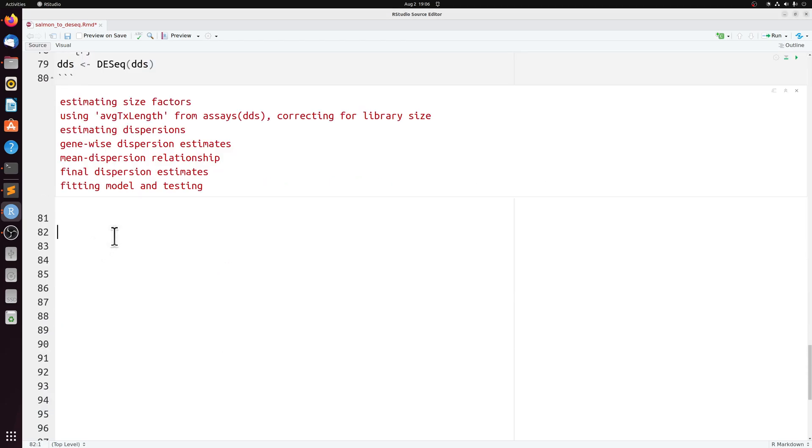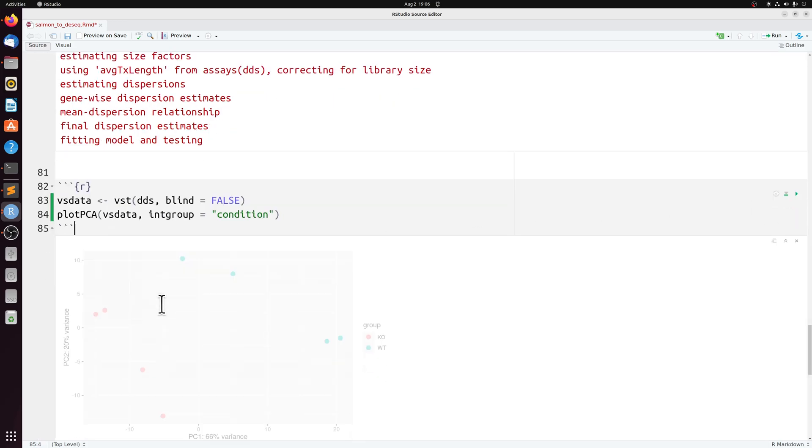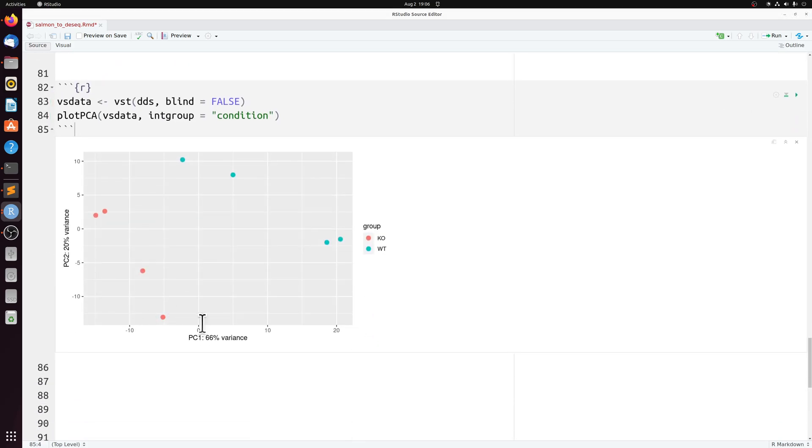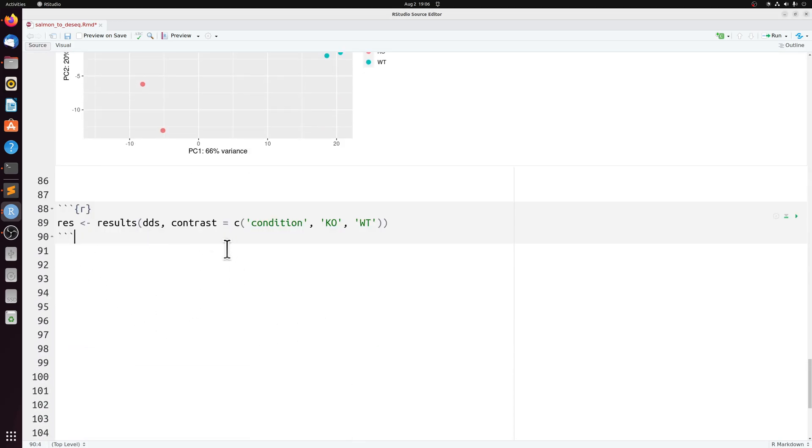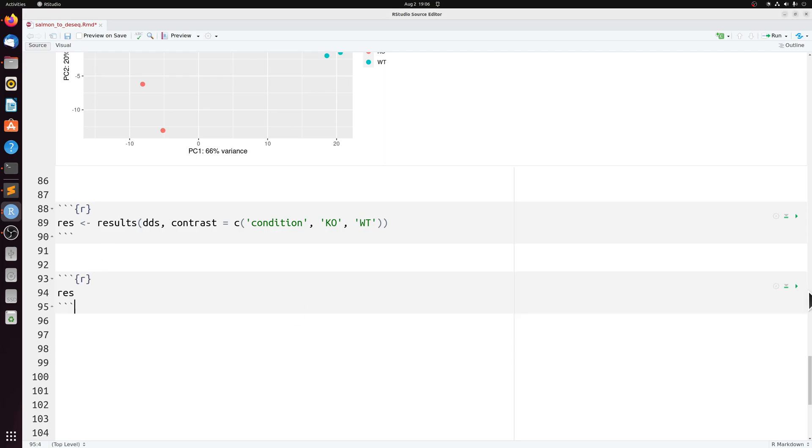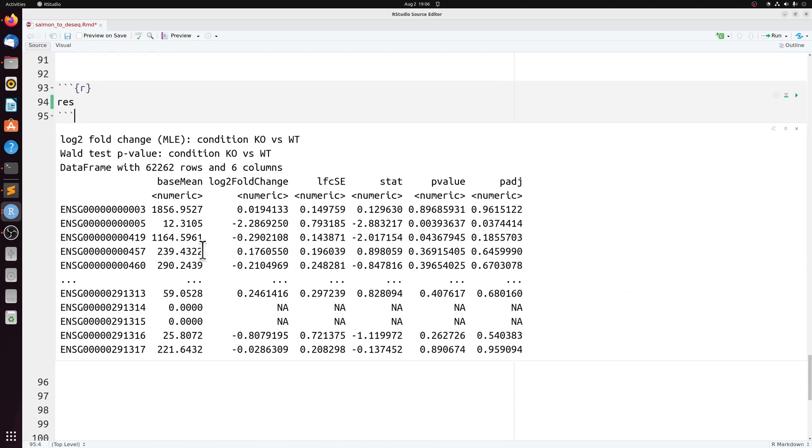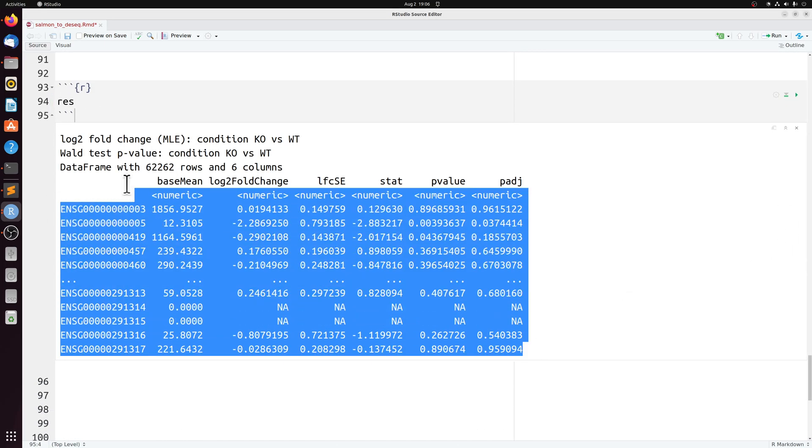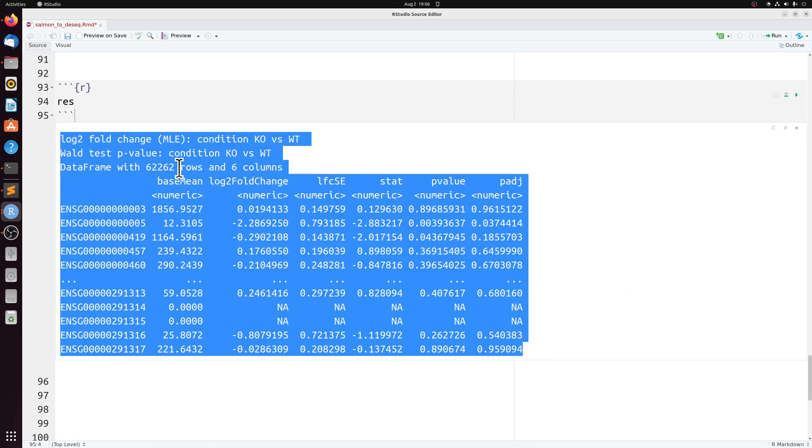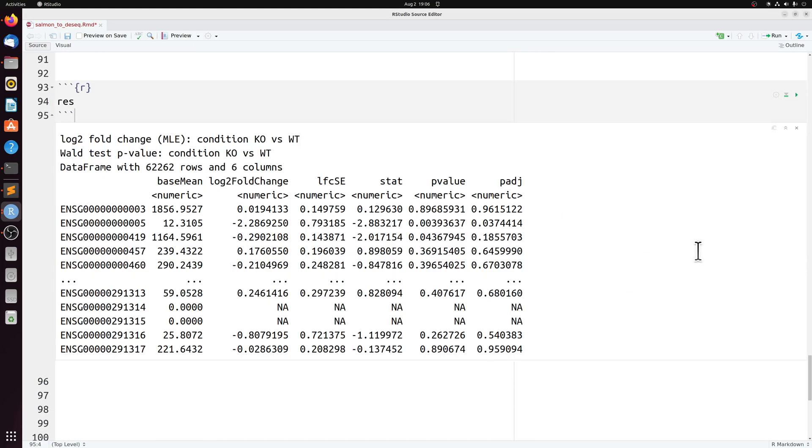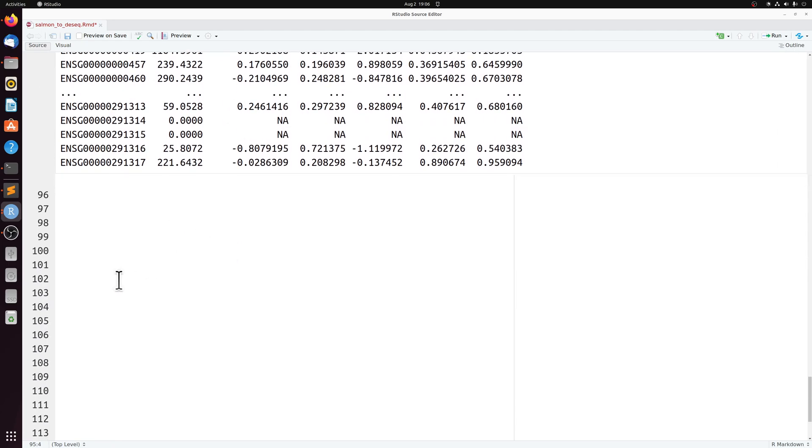We can plot the PCA if we wanted to. But importantly here, I'm just going to do the differential expression between our knockout and wild type. So if we look at res, these are the actual DE results.